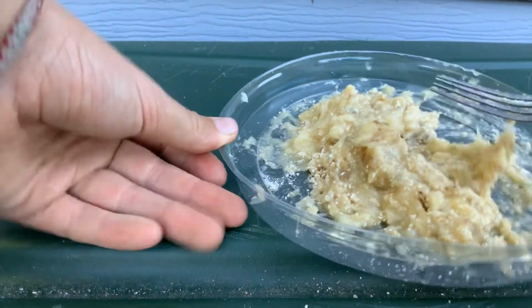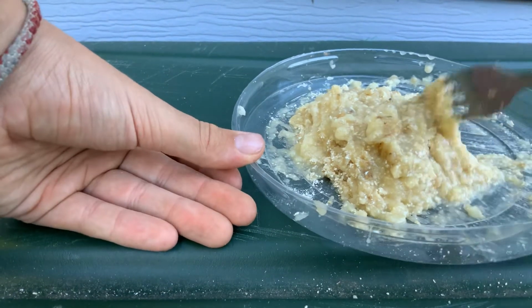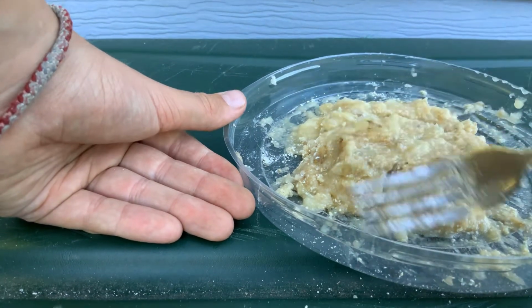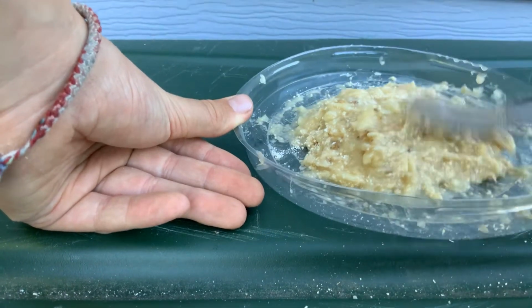And then every time a culture dies off, you should have another one ready. And so you have to make it 2 weeks before the culture should die off. So whenever you make a culture, please label it, or that'll be a big problem. So I think that that's enough.